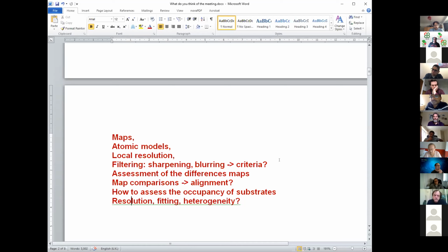I mean, isn't it a little bit of a culture issue? Because I guess in the X-ray community now, you're used to getting validation reports and you're used to having to look through them. Yes. Look, I'm submitting my structures, my PDB files, etc. A while ago, we didn't have such a report. Such a report, my impression, came only last year. Yeah, that's exactly. We are doing a good job, but to some extent, we need to check what's going on. We have somehow to investigate.